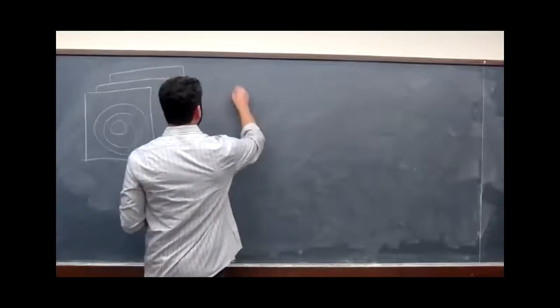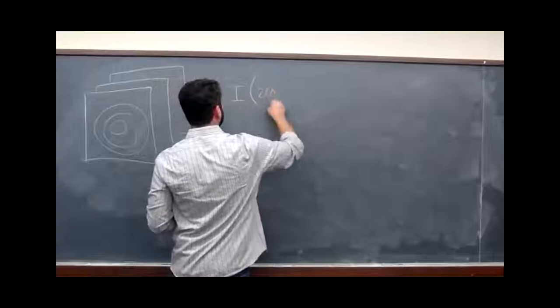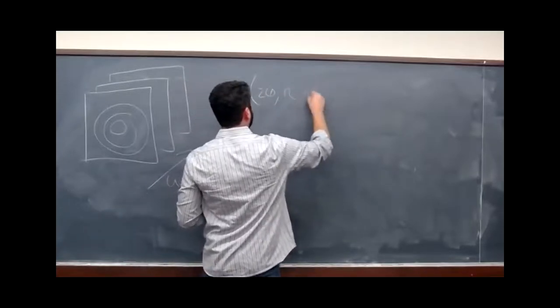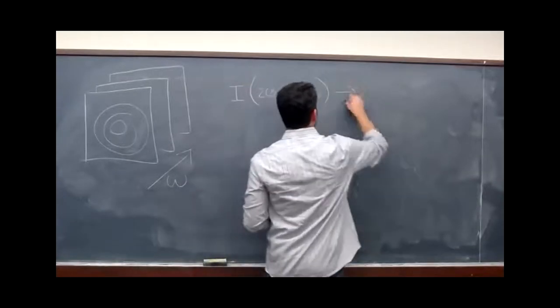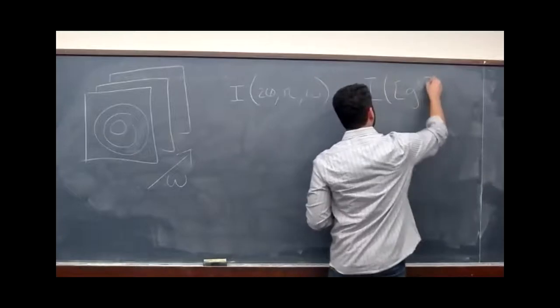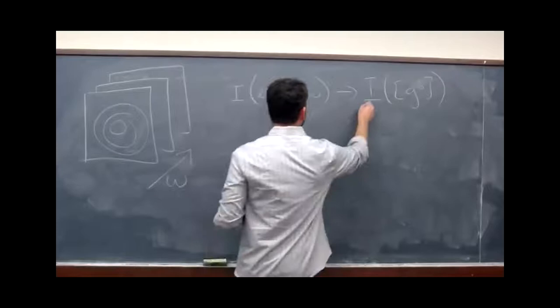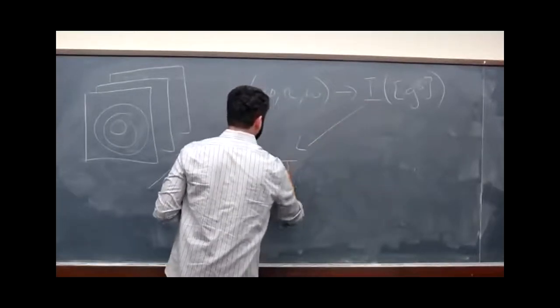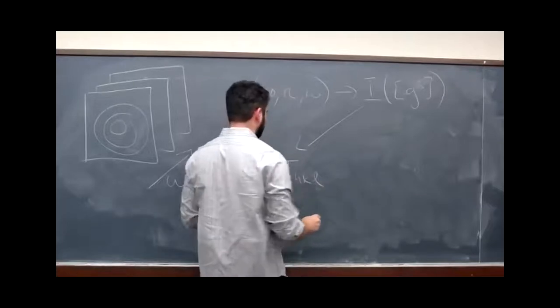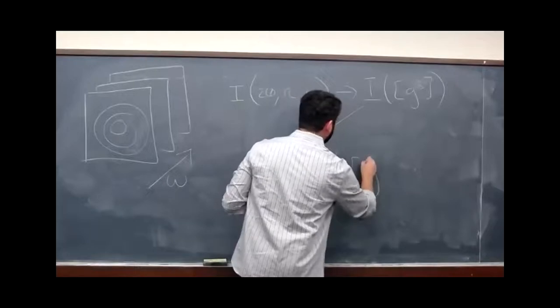And so we can take something like our intensity that we've mapped to a point in reciprocal space. We can now take each of those shells from a family of lattice planes and map that to the unit sphere.